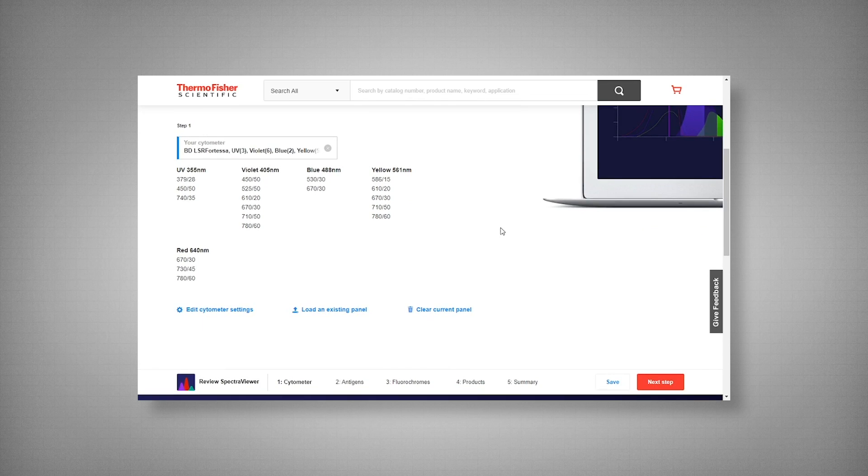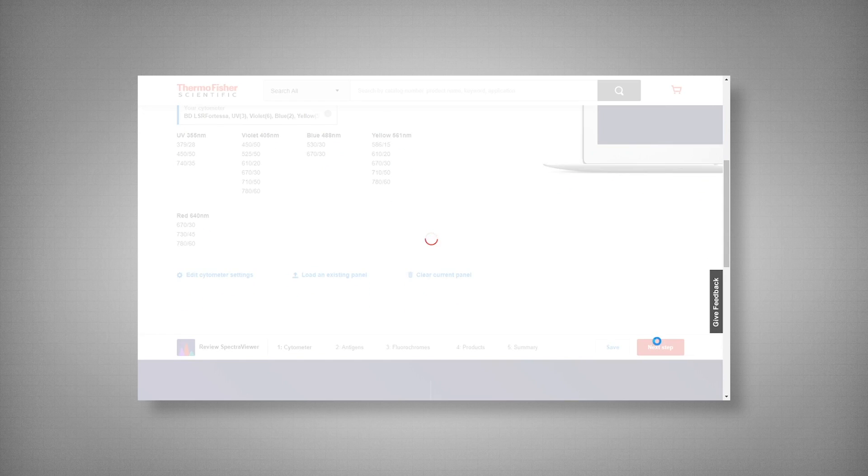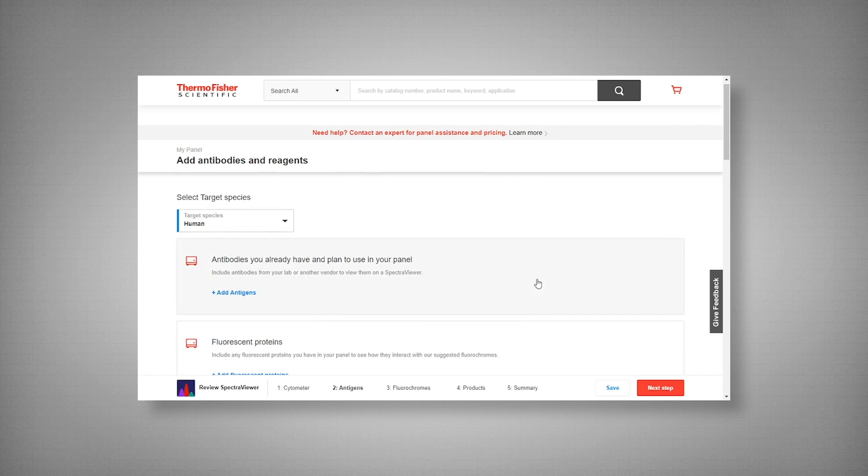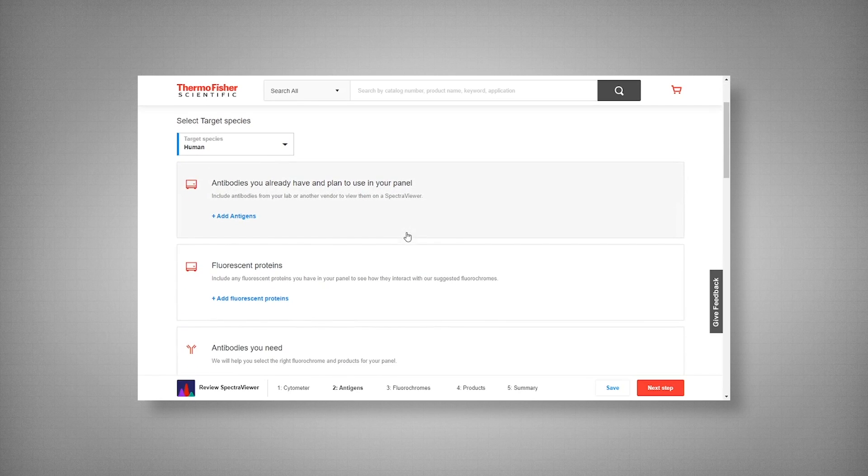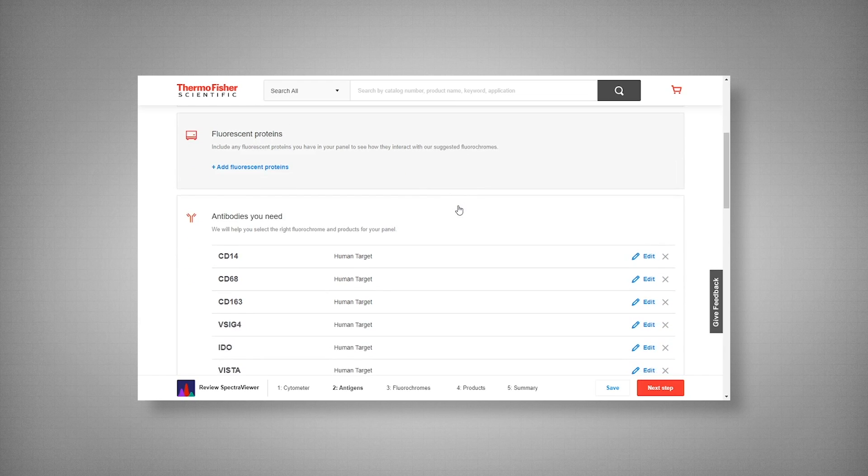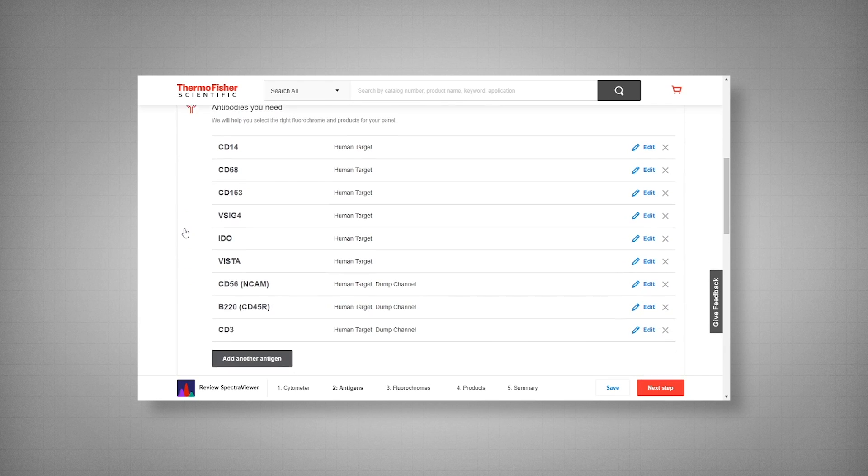Our next step is to enter our markers and viability dye. For the purpose of this experiment, the target species is human. Now here you would enter any antigens that you currently have on hand, fluorescent proteins such as GFP, and next the markers we need.